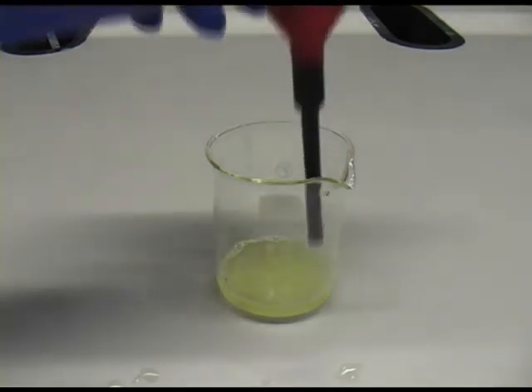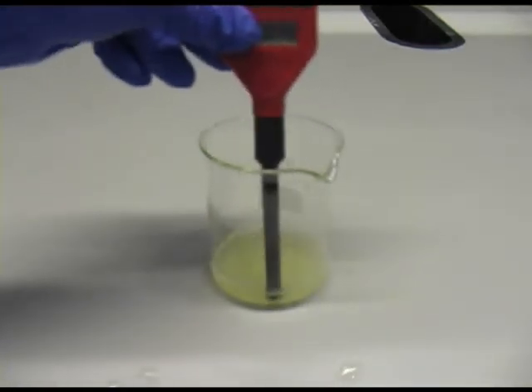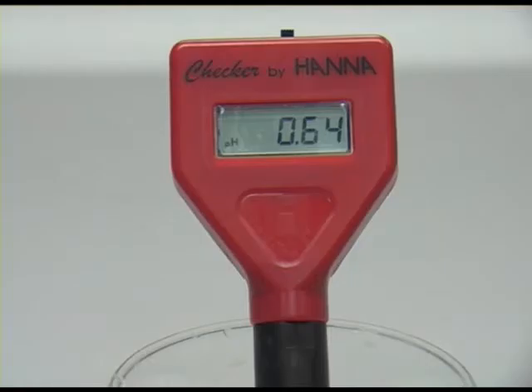In the beaker we have a strongly acidic solution. Once the reading is stabilized we can see that the pH value is between 0.6 and 0.7.